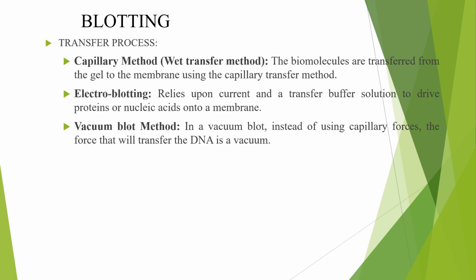Transferring process of blotting technique. Here we use three types of methods. First type is the capillary method, also known as the wet transfer method.